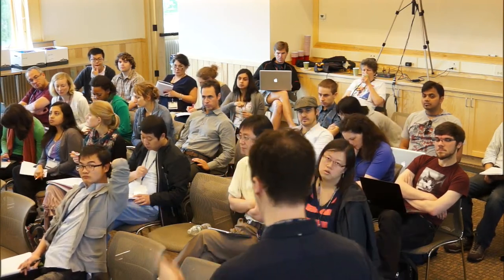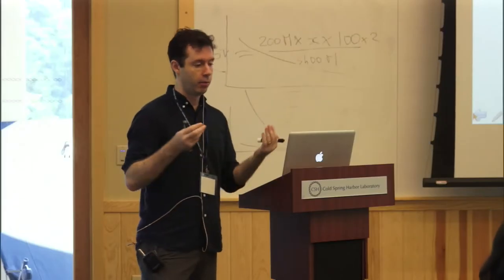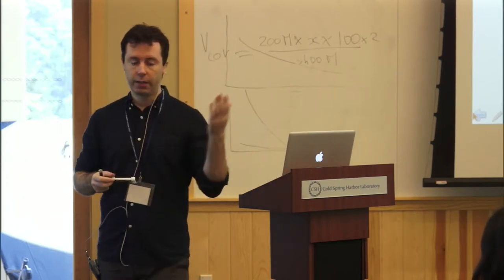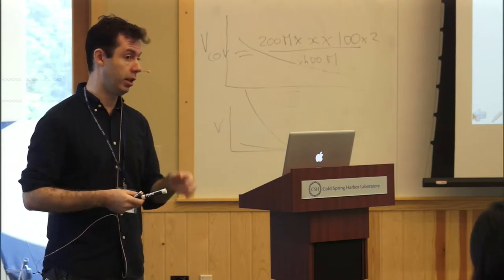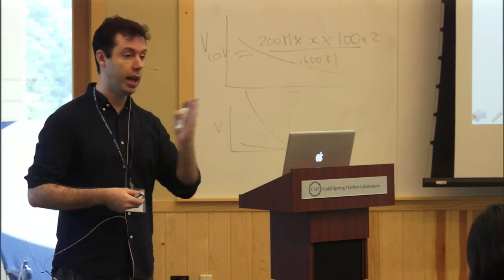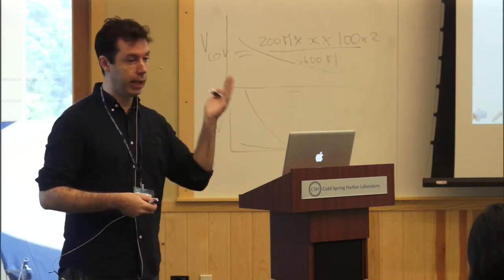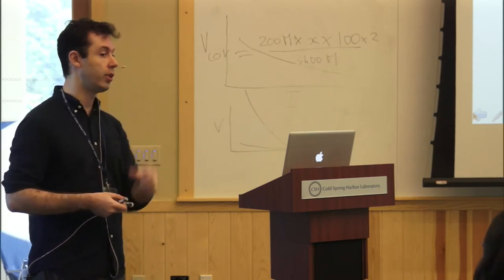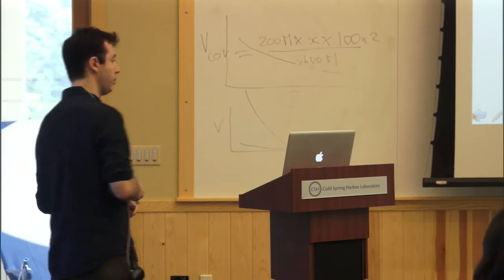For example, in the experiment I wanted to put on the slides, where we had these low quality scores towards the end, we didn't trim the end initially and were getting 5% alignability. Just trimming a few nucleotides at the end allowed us to get back to 90%, 95% alignability. So the software is not always very good at eliminating those situations.